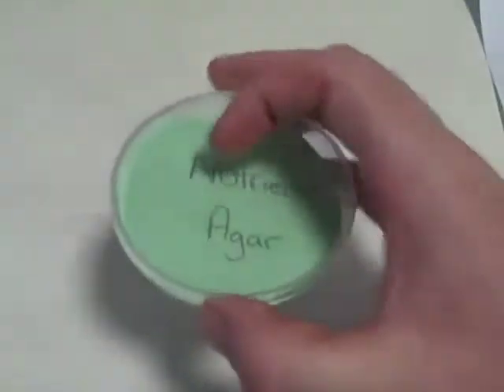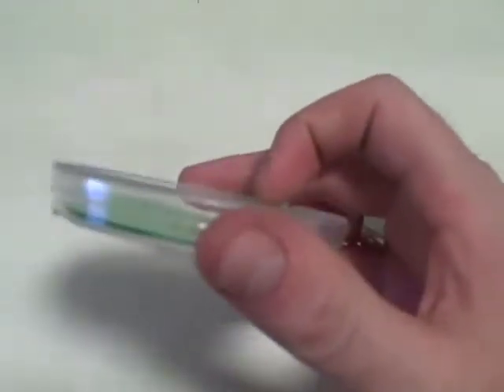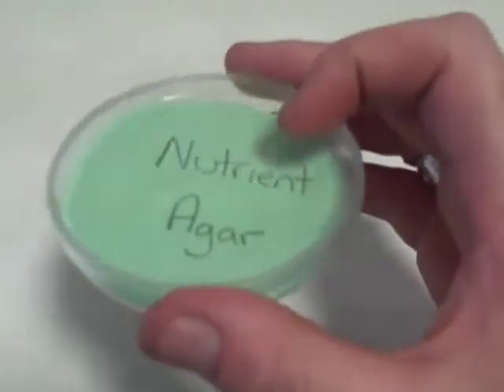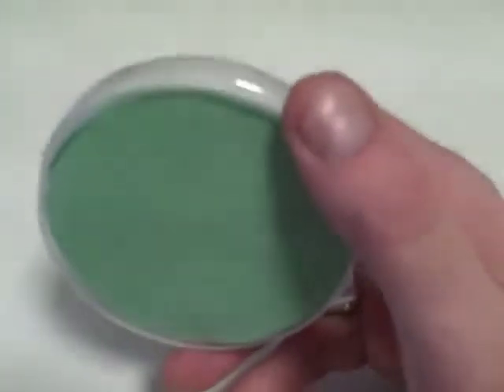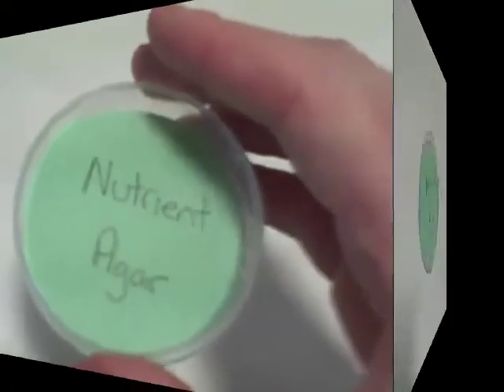Today, you are going to be making one of these, except yours is going to have real nutrient agar, minus pretend. The idea of this is that you can grow microbes in here. The agar is jelly, covered in food for microbes to grow on.